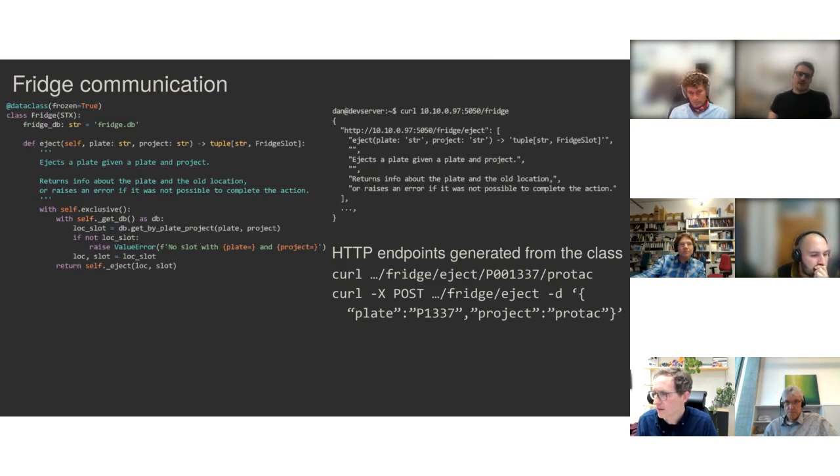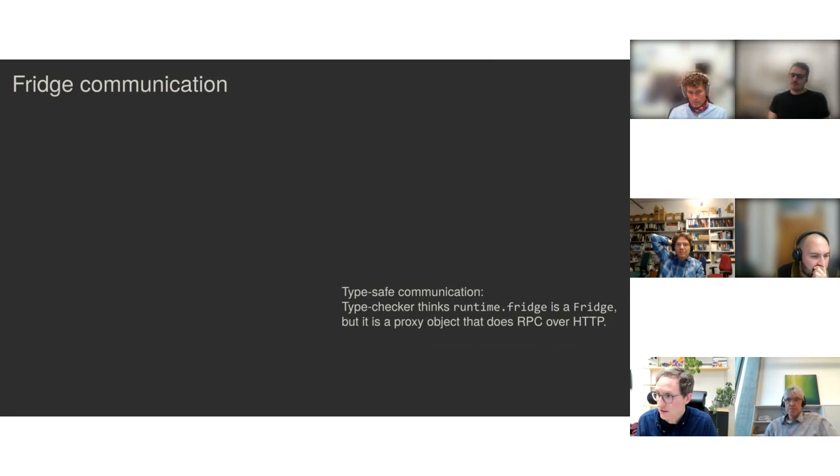But for my developer ergonomics, it's quite easy. I just make the methods. I can make documentation. I add the arguments and their types, and I get some documentation generated. But the more important thing is that I can just access this as web endpoints.